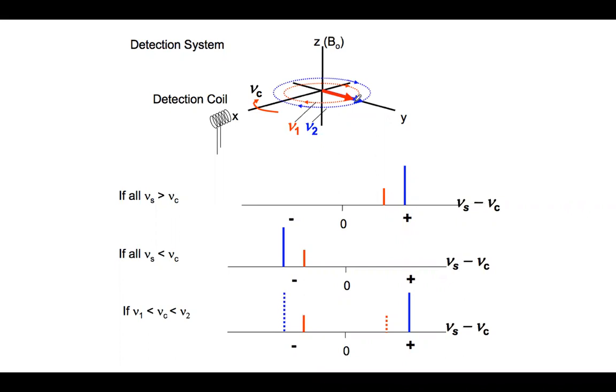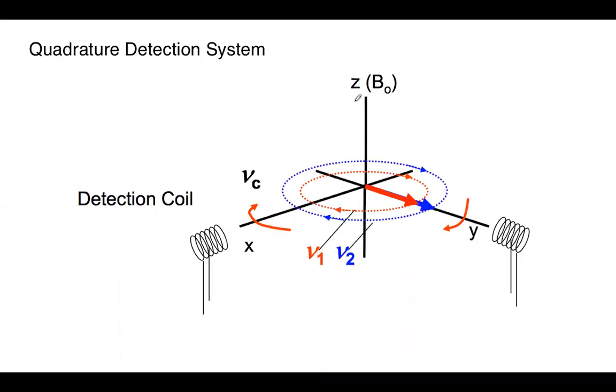we're able to decompose that complicated time domain spectrum into a frequency domain spectrum. And so the overlapping of the dipole moments of different strengths means that we're able to get a decent signal out of all of it and resolve it into the frequency domain. So we get peak positions and peak areas for the samples that we're interested in.